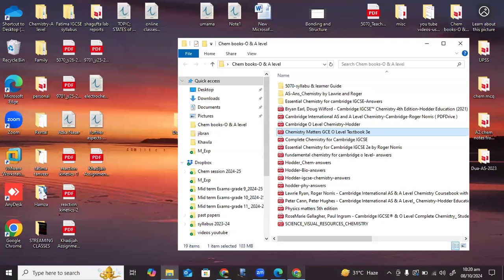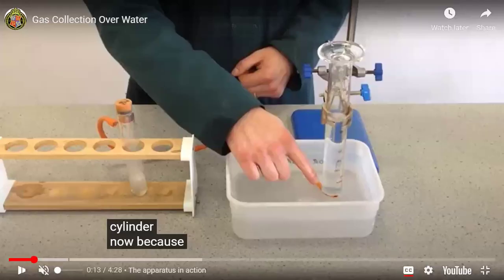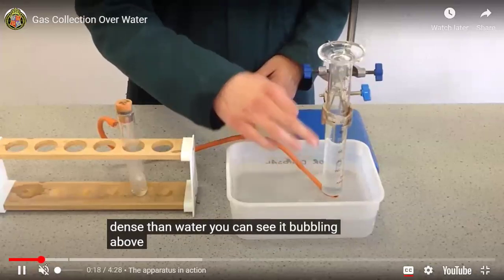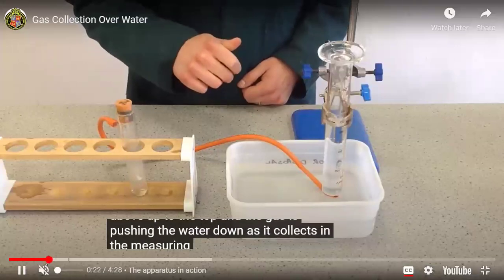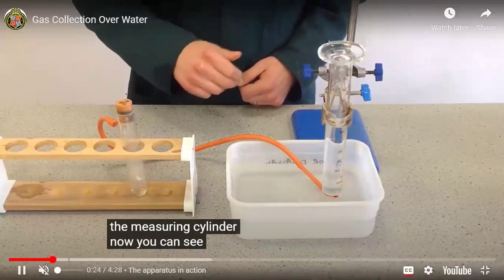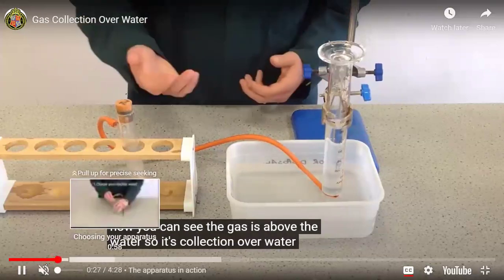We have a video of this one. A person is collecting a gas over water. You just see that a gas is produced in this test tube and it is connected with a rubber tubing, and then we have a measuring cylinder so that we can measure the volume of the gas produced. Now let's see the setup.